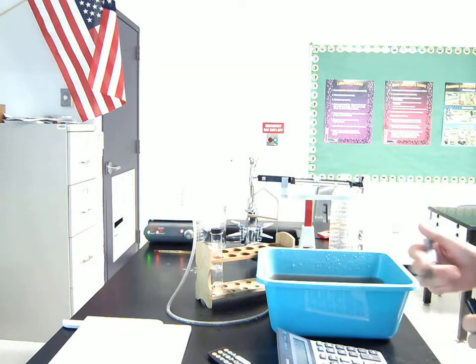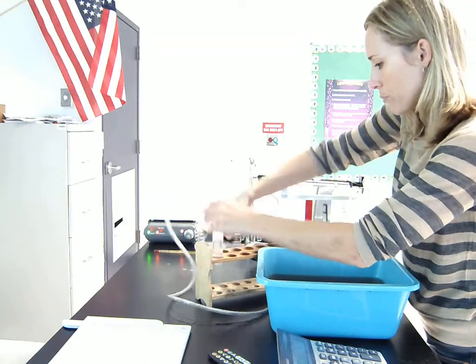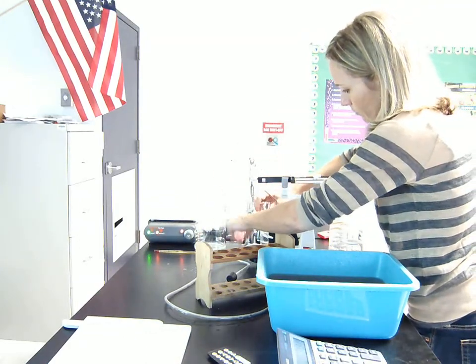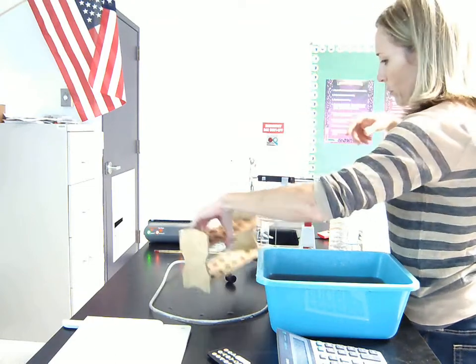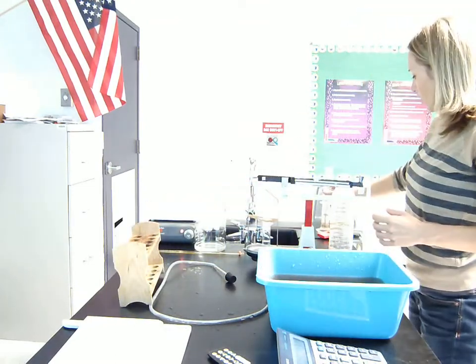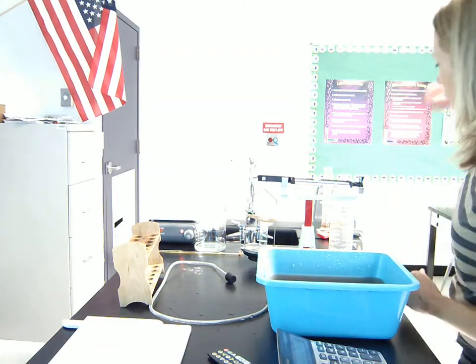Okay, now let's do our mass. Alrighty. Now the reason we have the rubber band on there is to keep the test tube from falling over. And again, as long as we have that on there at the beginning and at the end, we're good to go. Okay, so let's see.